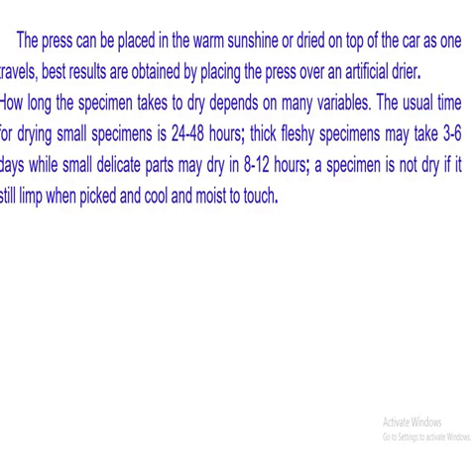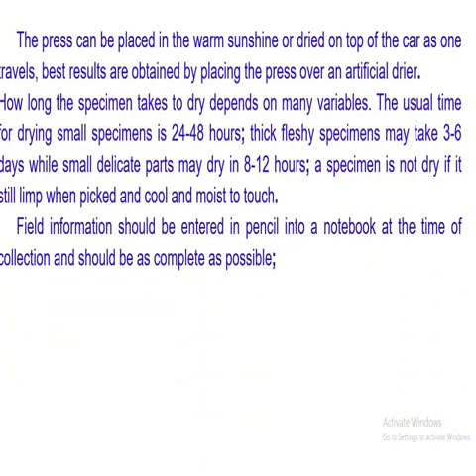If you find your plant is still cool and moist, return it to the plant dryer and keep monitoring until it dries properly. But now ensure that your plant does not roast in the plant dryer. Let the plant just dry, and as it dries, let the integrity and the appearance of the plant be as it was when you collected it in the field.